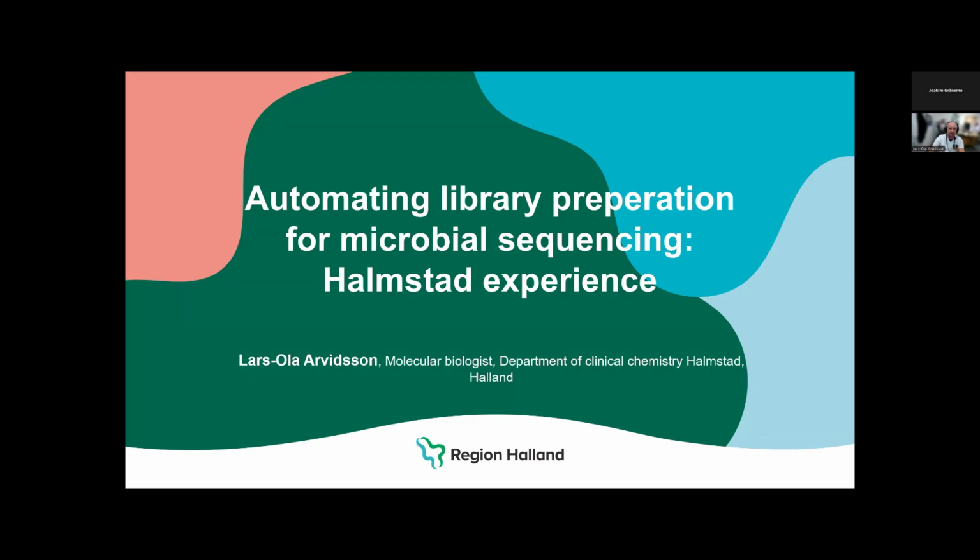The presentation I'm going to have here today is going to be about the work we have done to automate the otherwise rather laborious sequencing workflows. As many of you might be familiar with, the protocols for nanopore kits involve a lot of steps. So the process as a whole requires that you get each and every one of those little steps right. And this can sometimes be asking quite a lot.